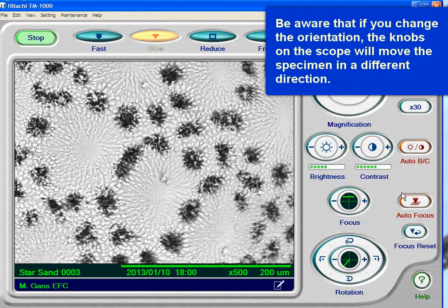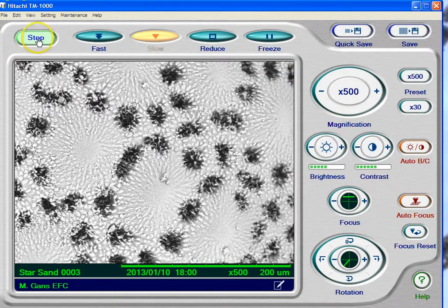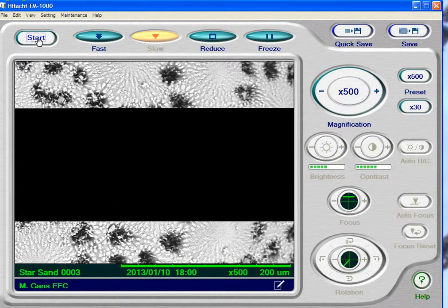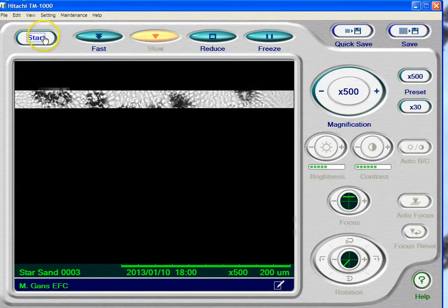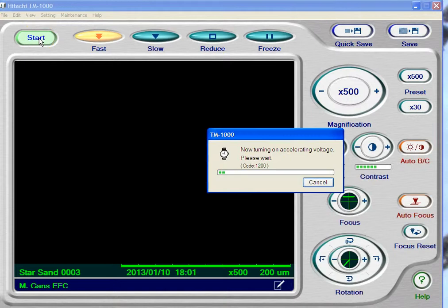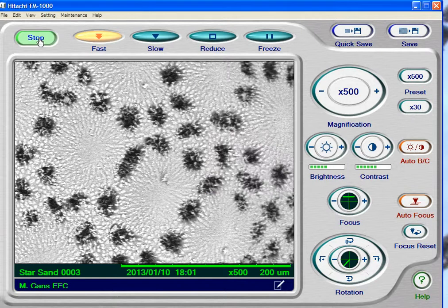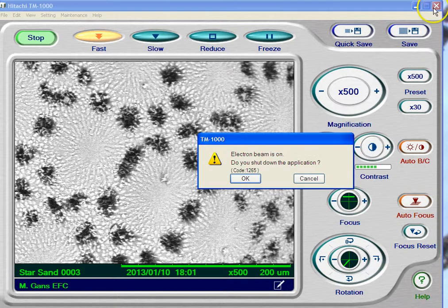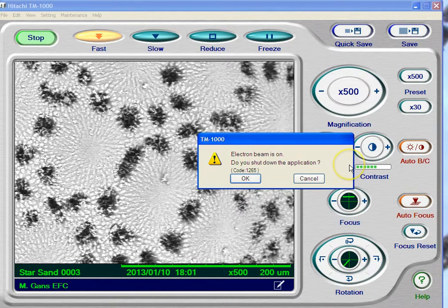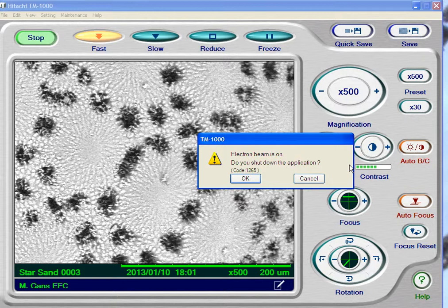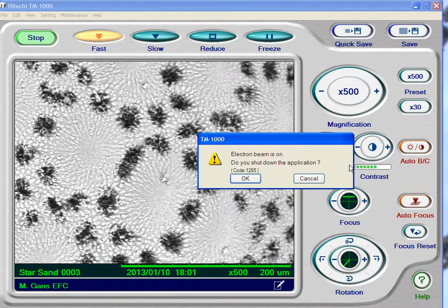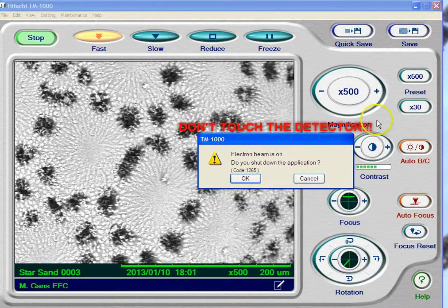So let's talk about the procedure for actually stopping this. The first thing you want to do is hit the Stop button, and when you do that you'll get a blank screen — you've actually turned off the electron beam. What happens if you forget to hit the stop button? Well, it won't let you make a mistake. If you come in here and just close the program, it says 'electron beam is on — do you want to shut down the application?' In other words, this scope is not going to let you actually do something that's going to hurt it. The only way you can hurt the scope is if you touch the detector or bang the specimen into the side of the scope. So that's a pretty good safeguard.